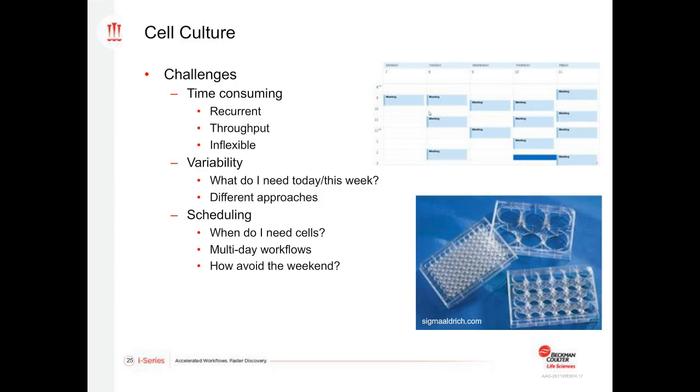In addition, we know there are people in the lab who passage cells differently than I do. And so, for example, we all sort of come up with our own approach for passaging cells, and it sort of just depends on how we were taught or maybe what the written protocol says. But we know there's inherent variability in the way people do things. And so by turning to automation, this variability can go away because a lot of the times this variability will show up in your future assays.